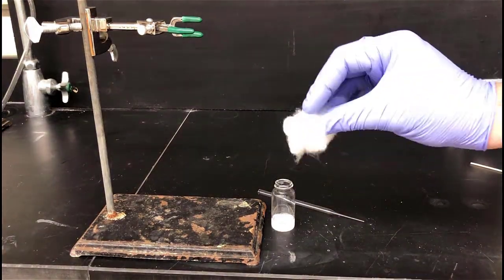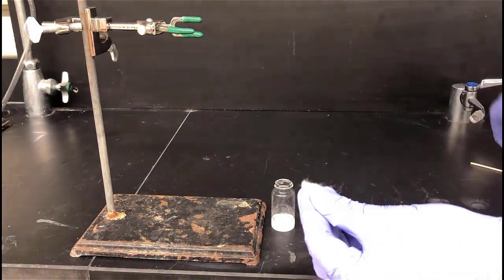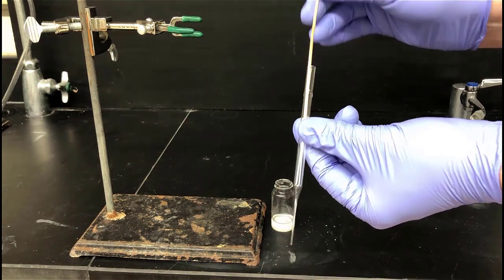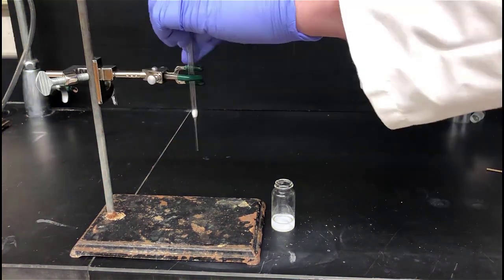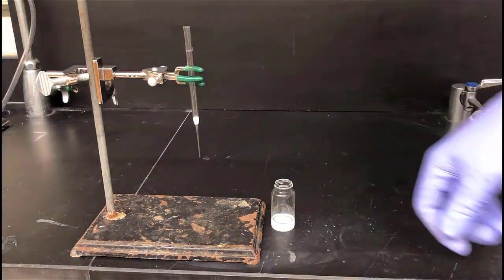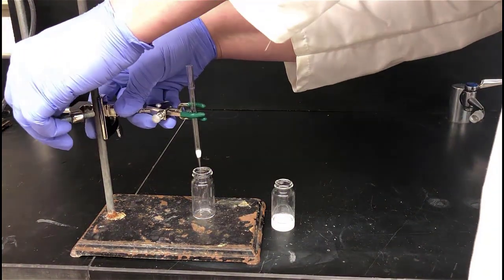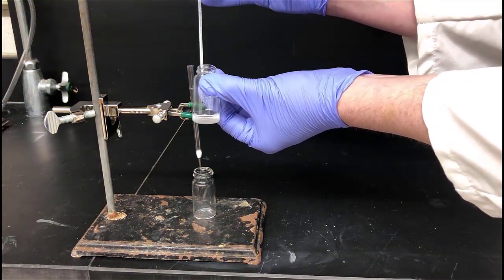After the mixture has sat for a while, we'll filter off the magnesium sulfate using a microfiltration apparatus. This consists of a small pipette with a little bit of cotton jammed into the tip. Push the cotton down into the tip of the pipette, clamp it to a ring stand, and then pipette the mixture through into a clean, dry, pre-weighed vial. The cotton will filter out any magnesium sulfate that gets into the pipette.